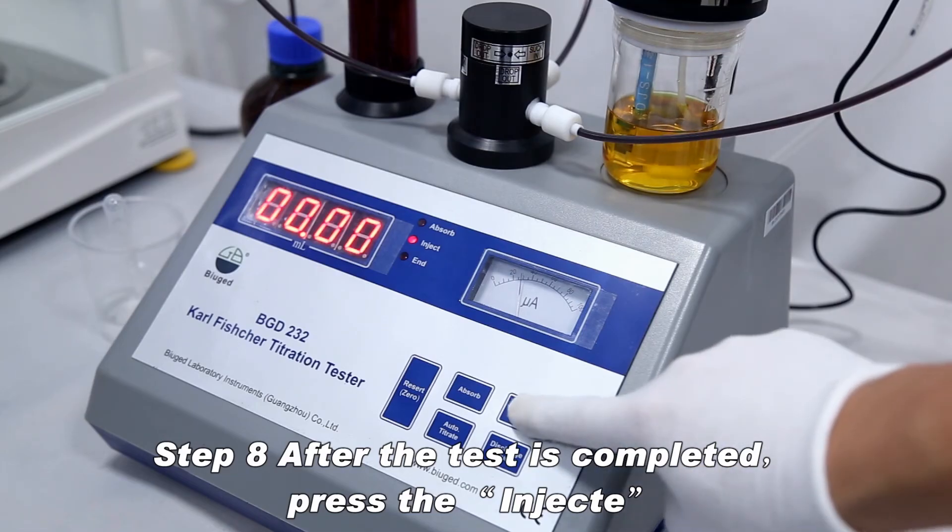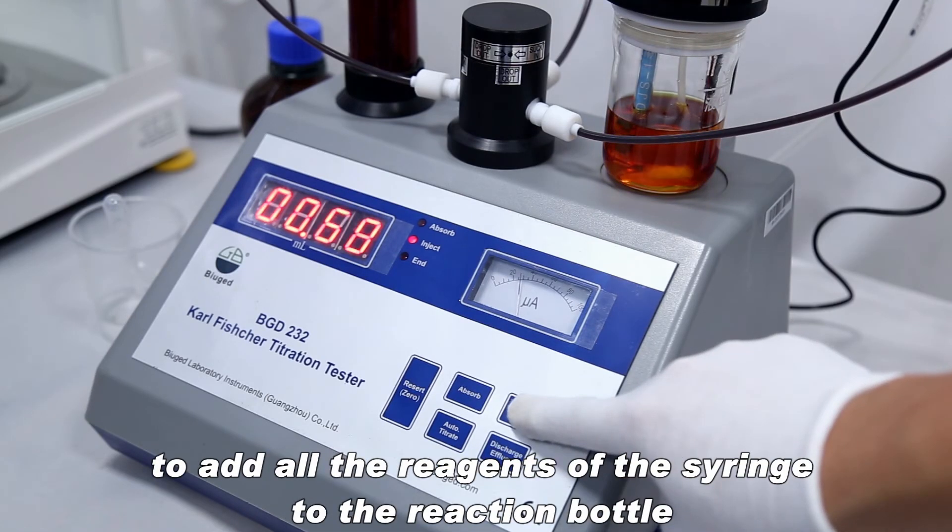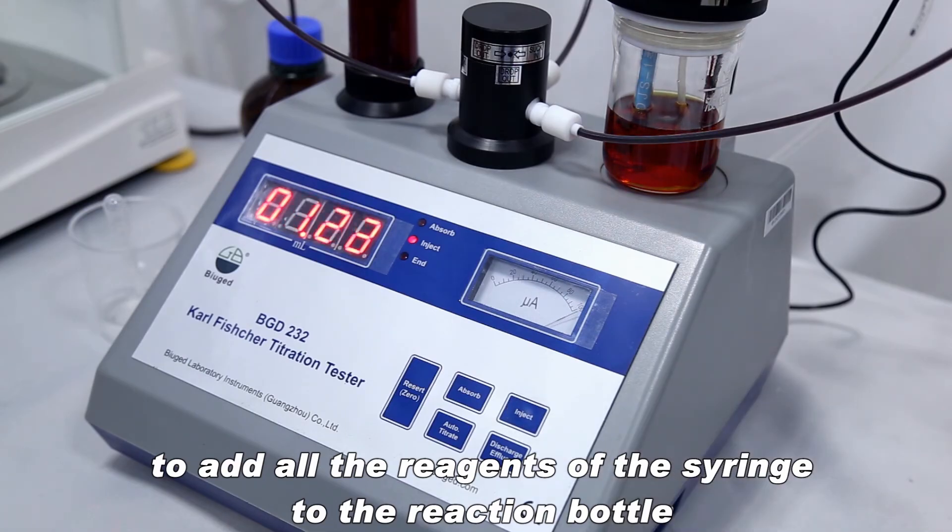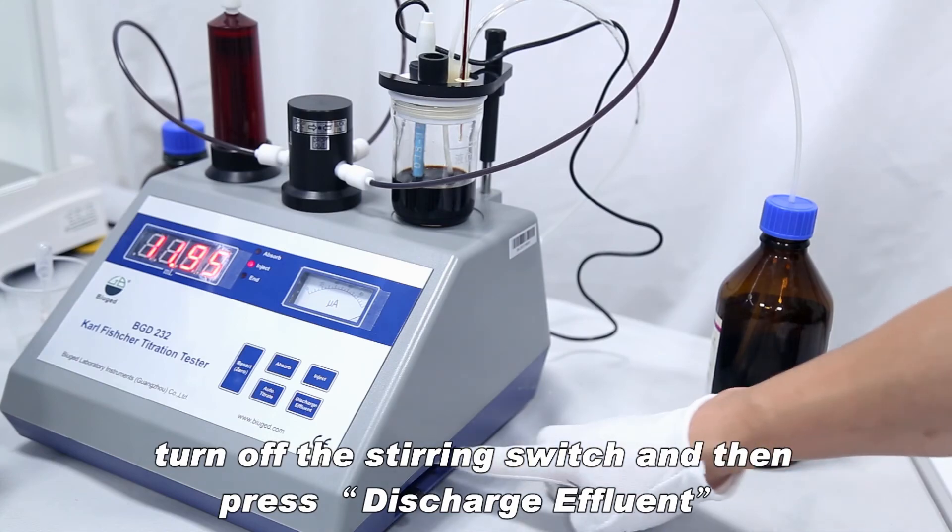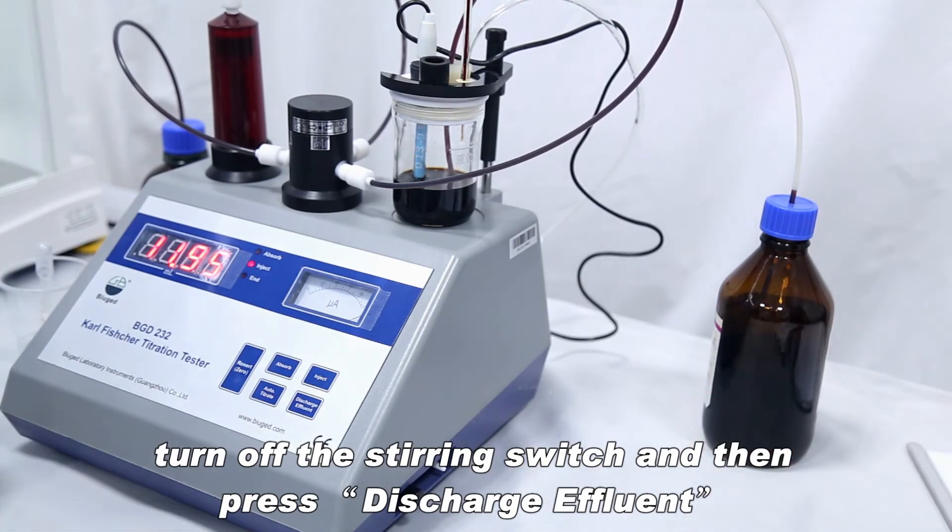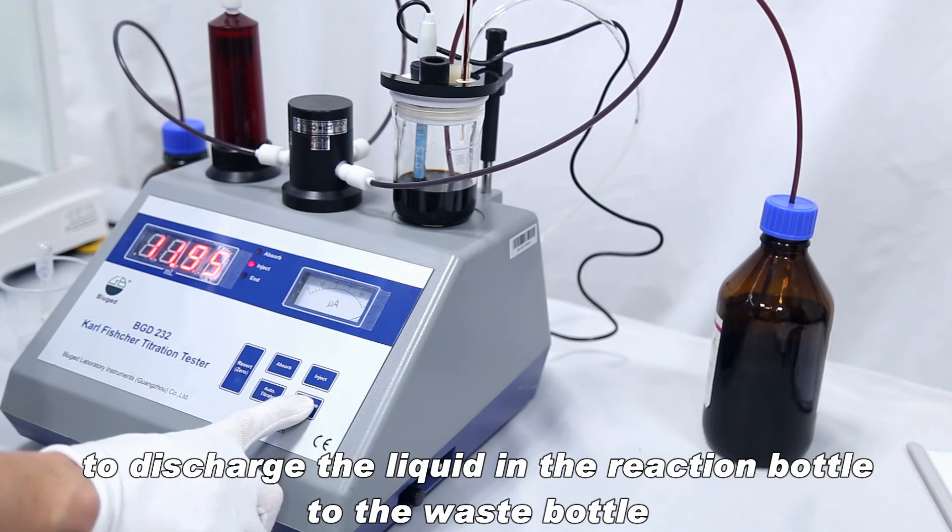After the test is completed, press the inject to add all the reagents of the syringe to the reaction bottle. Turn up the stirring switch and then press discharge effluent to discharge the liquid in the reaction bottle to the waste bottle.